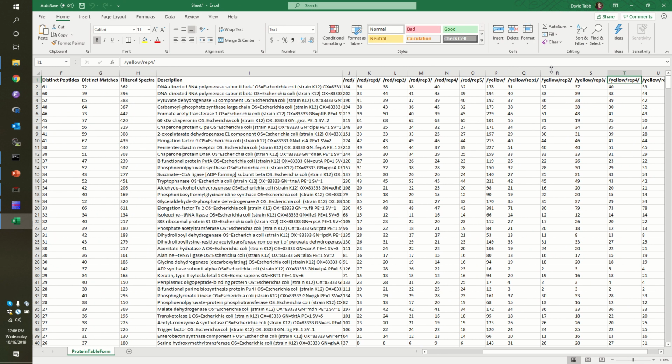Now in the next example, we're going to return to FragPipe, and we're going to look at how you would do this using Philosopher, not exporting off to IDPicker. Because once you've installed FragPipe, Philosopher, and MSFragger, you have everything you need to create tables like this in that software instead.